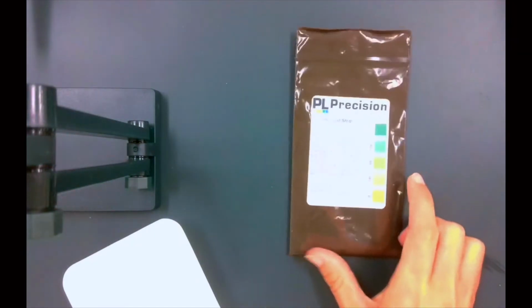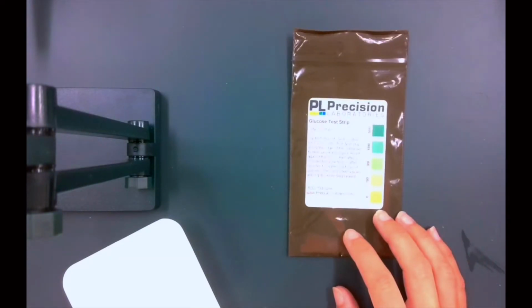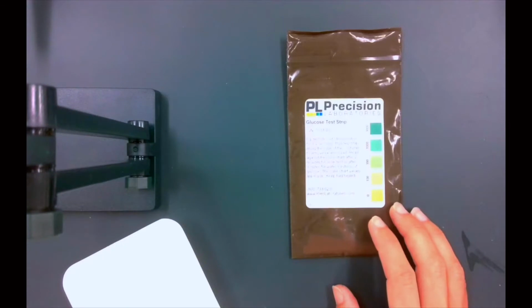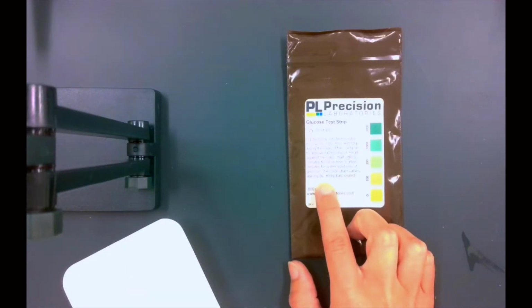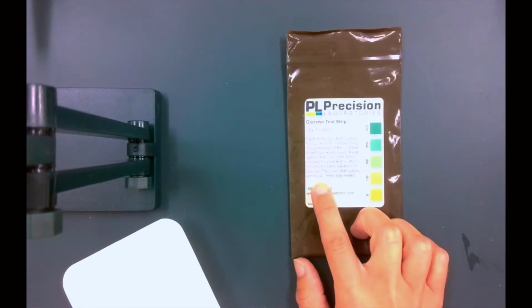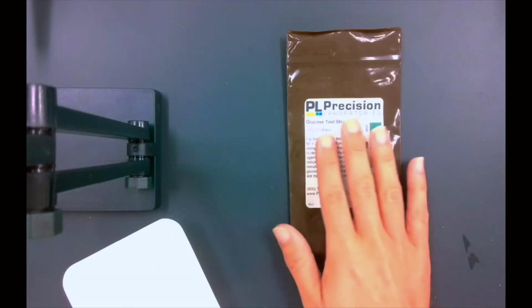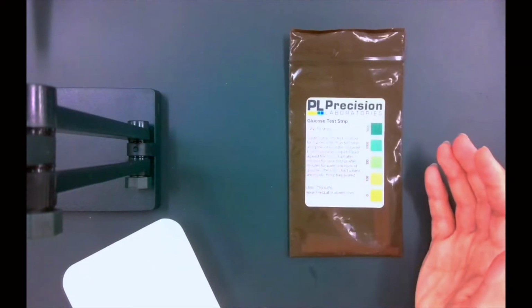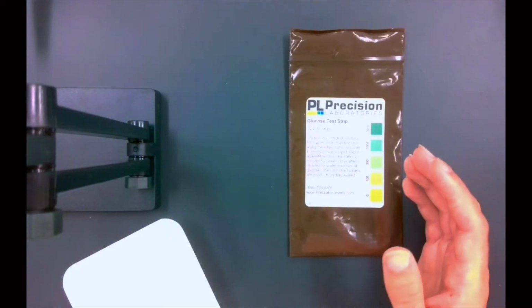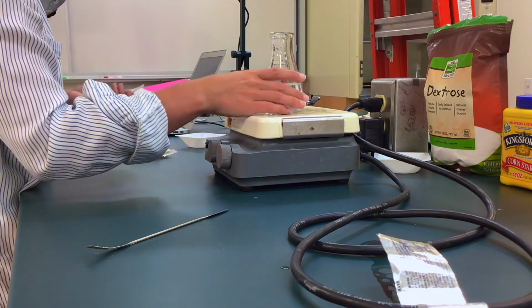What I want to do now is measure the amount of glucose in our solution using glucose testing strips. And this will give me a measure in milligrams per deciliter, which is a really typical mass measurement per volume in medical measurements. And these glucose test strips are usually used by people who have dietary issues centered around blood sugar to test the glucose concentration of food that they might be eating. So I'm going to do that with our solution.